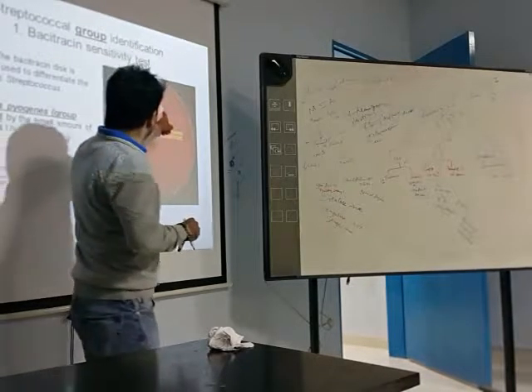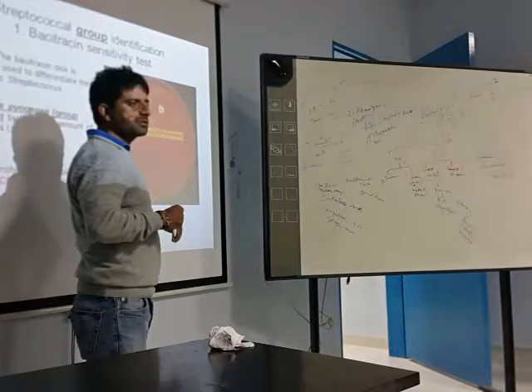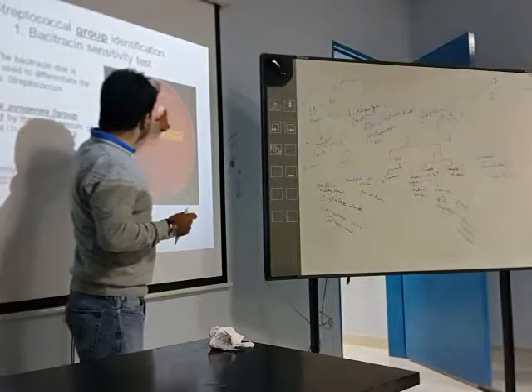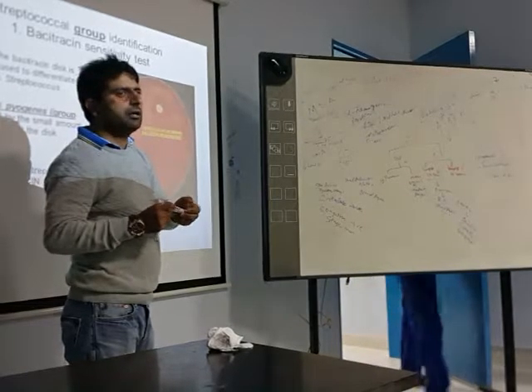This is the antibiotic disc. Put it in here. Have you seen the antibiotic disc in the laboratory? It is just a small piece of paper, and it contains the antibiotic.